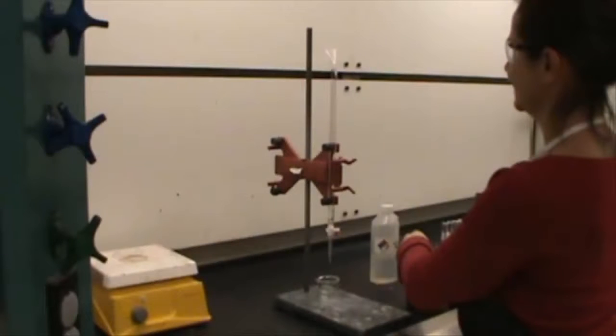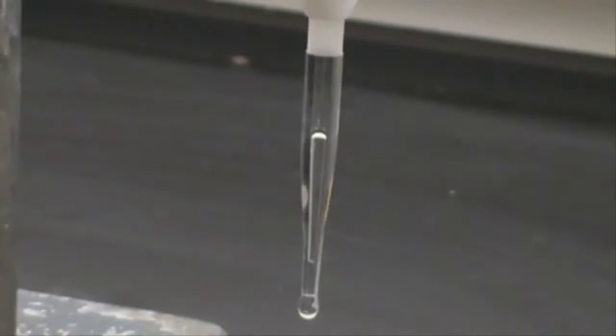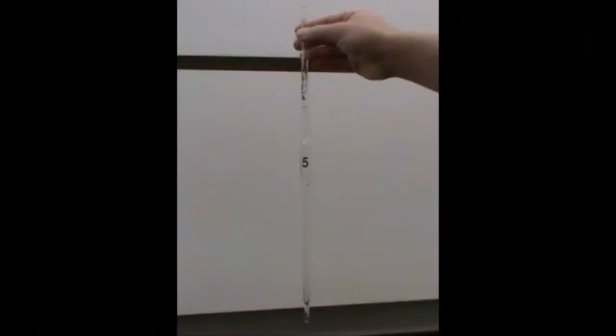You'll be using a burette as shown in the last lab. Transfer enough sodium hydroxide into the burette to get past the 5 milliliter mark and adjust the meniscus to 5.00 milliliters. Make sure there are no bubbles in the tip. Another method of delivering an exact amount of volume to glassware is through a volumetric pipette.